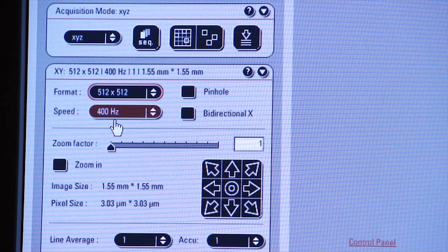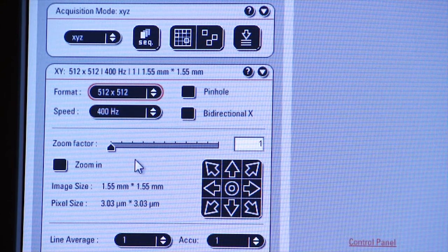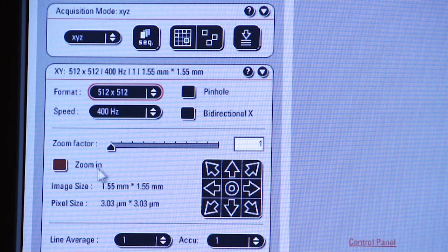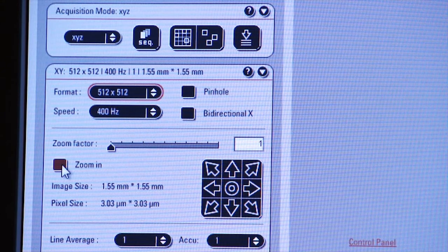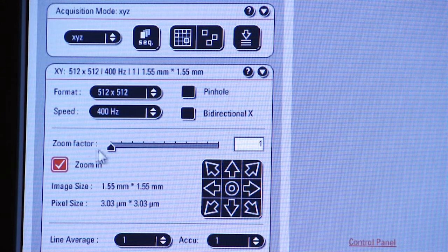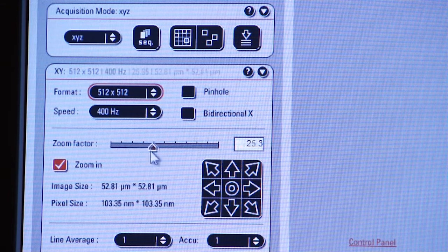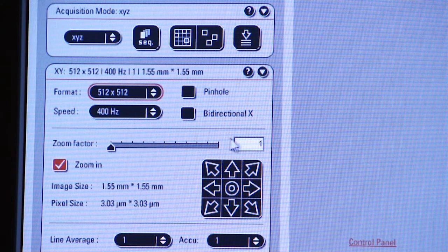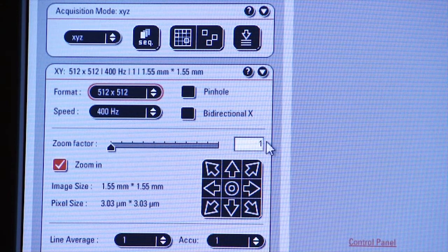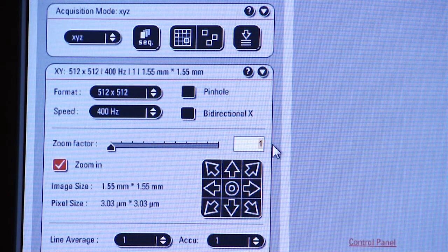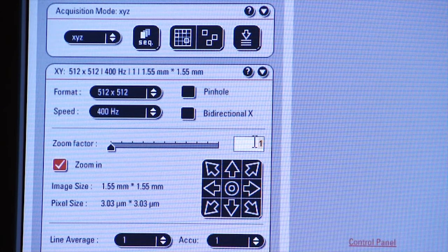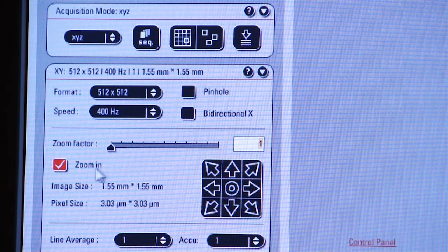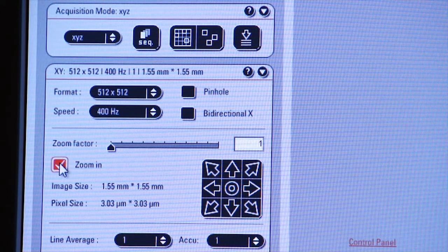There's also a box that you can click on, and you can control zoom manually with this tab. Or you can type in a zoom factor here, and the system will zoom to that factor. But we're going to leave it at 1 for now.